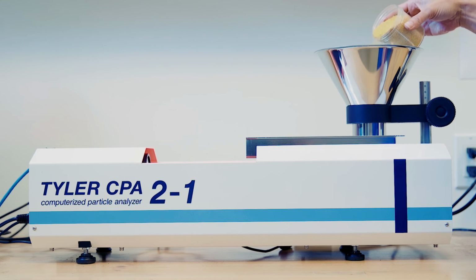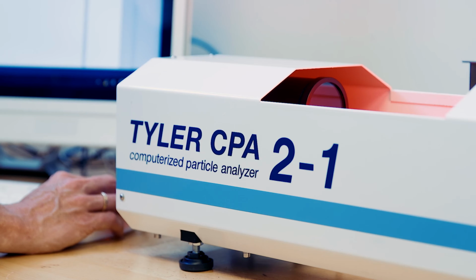To comply with your particle analysis standards, it is recommended that you keep a stack of master test sieves and test your material monthly. The correlation of these results will allow you to check the accuracy of your dynamic image analysis system.